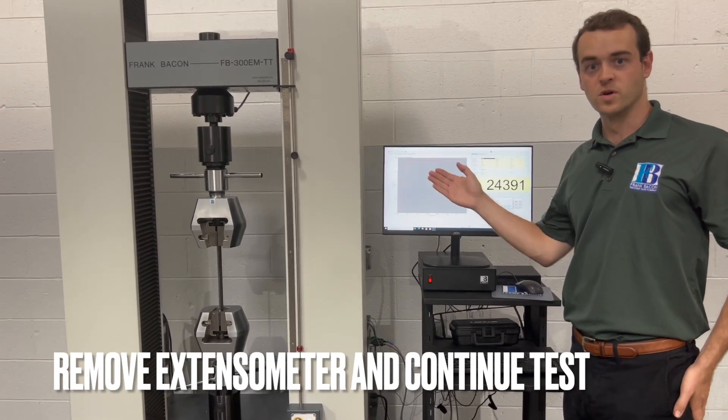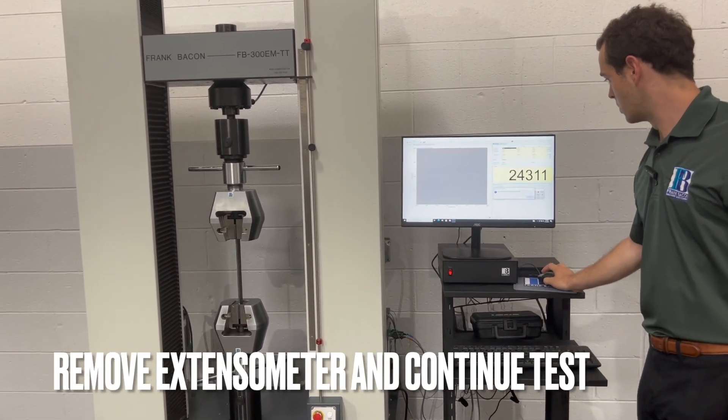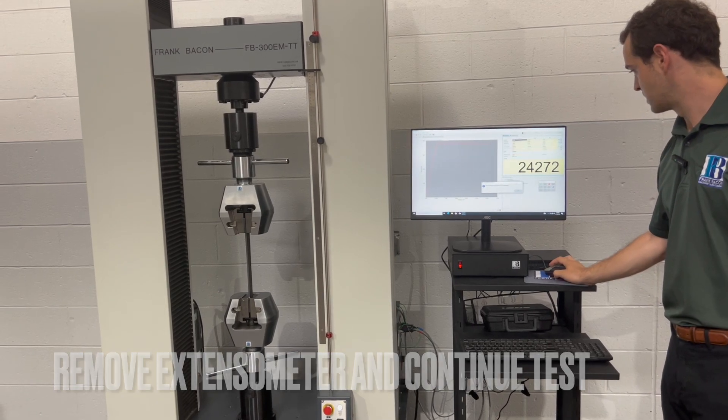The machine just prompted us to remove our extensometer. We pulled that off and now we're going to run the rest of the test without the extensometer until failure.